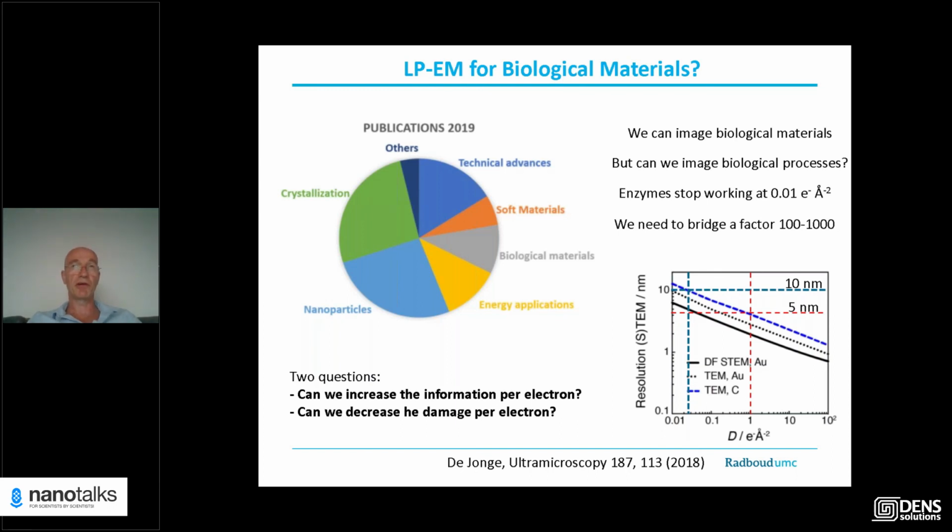This is a very, very good question. We have been able to keep solutions inside the graphene liquid cells liquid and intact for 24 hours. But it is not a perfect technique yet, so it does not always allow us to keep the solution or the cell intact for that long.